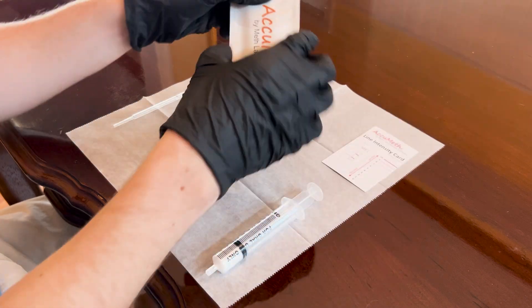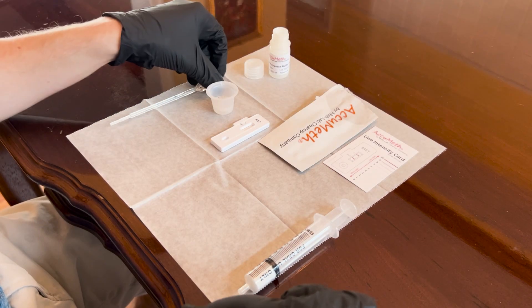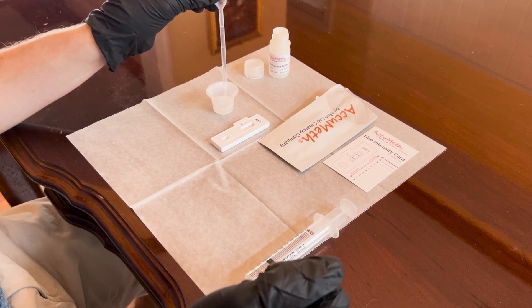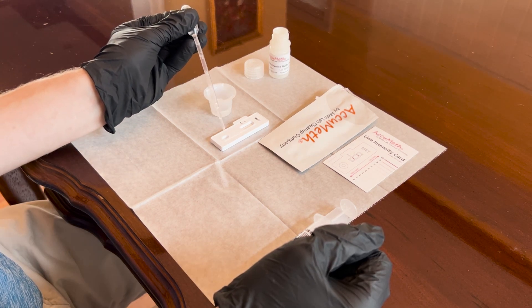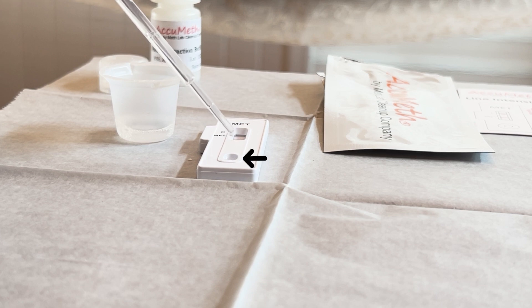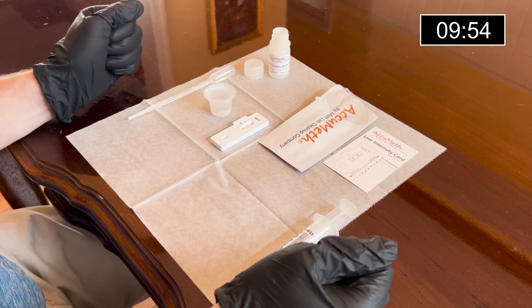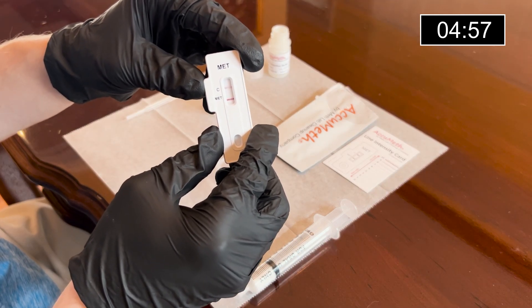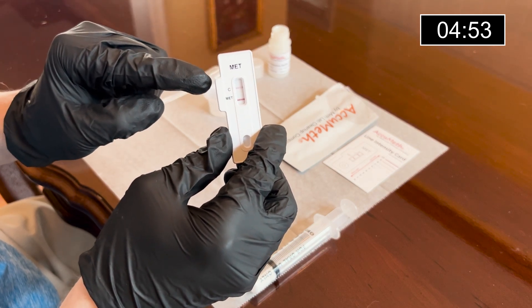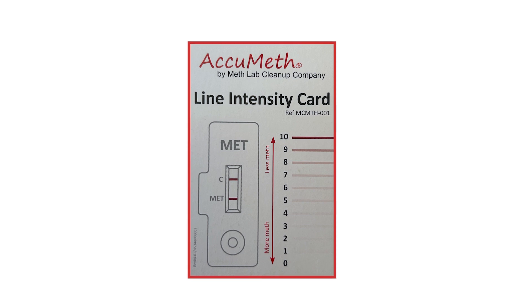Now we are going to perform the test procedure. Remove the test cassette from the foil pouch and place it on the wax paper. Pipette up the extracted sample from the plastic cup, holding the pipette tip slightly up so as not to spill the buffer. Add four drops — and only four drops — to the sample well, which is the circular area on the test cassette. Set a timer for 10 minutes. We are going to read the test result after five minutes has passed, but not after 10 minutes. The C is the control line and should be present regardless of whether or not your sample is contaminated. The MET line is the meth residue line, which we will compare with the line intensity card provided.